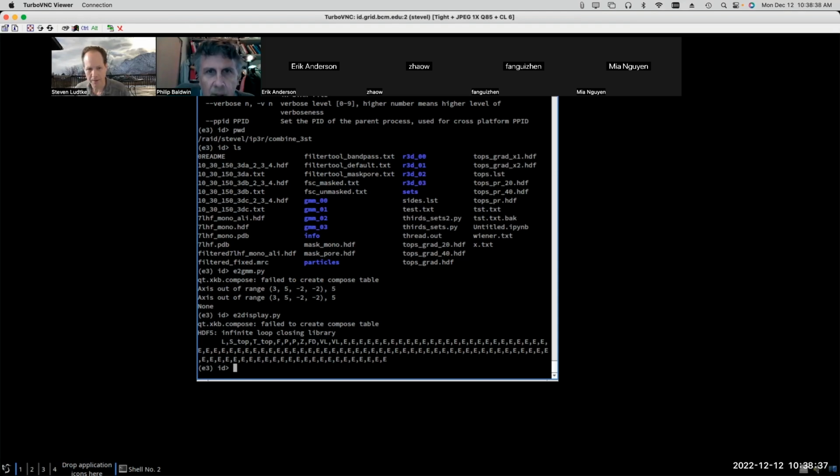All right, great. Well, feel free to email me if you have any questions that I didn't manage to cover today. I realize there's still quite a lot to understand if you want to really make profitable use of the GMM stuff. But if you've got a project where you've run an EMAN refinement, or you could take a RELION project and convert it to EMAN, you can give it a try and see what sorts of results you can get out of it.